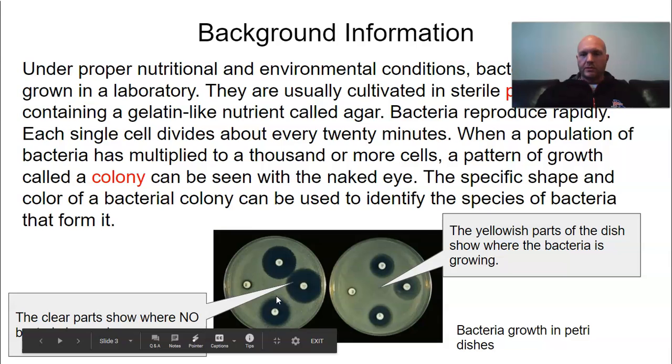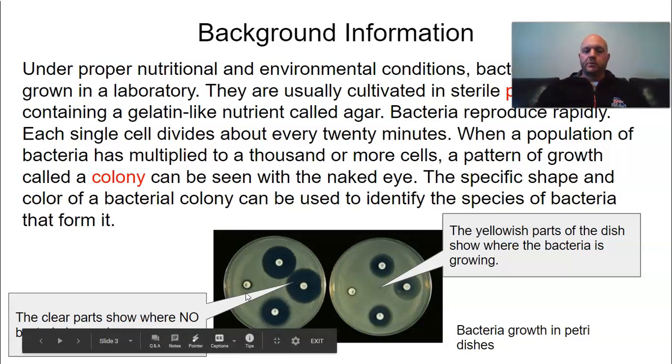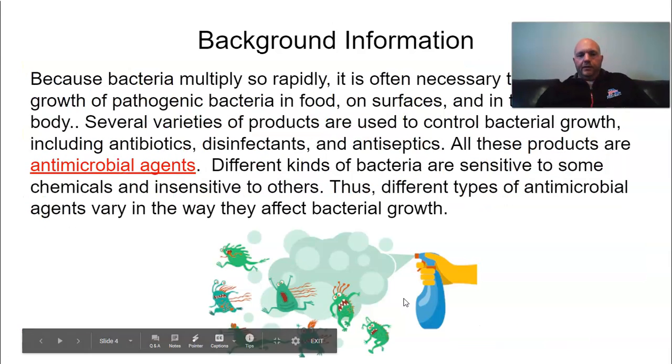The obvious controls are the same things. Time, the amount of substance you put on there, the shape of the disc. This one that has just paper. Those are the things you're looking for. And then you're going to go from there.